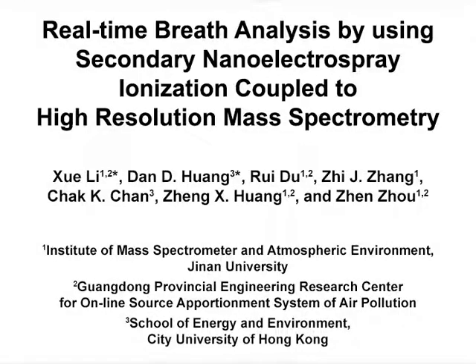The overall goal of this experiment is to characterize chemical composition of exhaled breath using secondary nanoelectrospray ionization coupled to high-resolution mass spectrometry. This method can help to answer key questions in the medical field, such as early diagnosis of diseases, therapeutic drug monitoring, and environmental exposure. The main advantage of the technique is the measurement can be performed in real time.